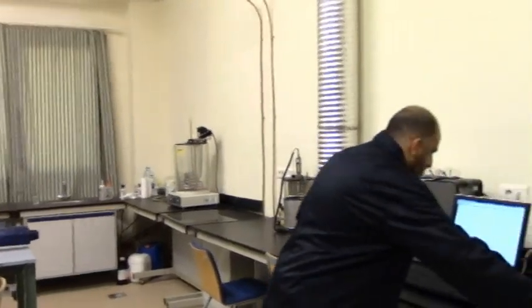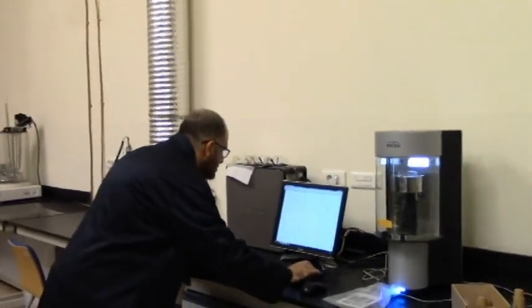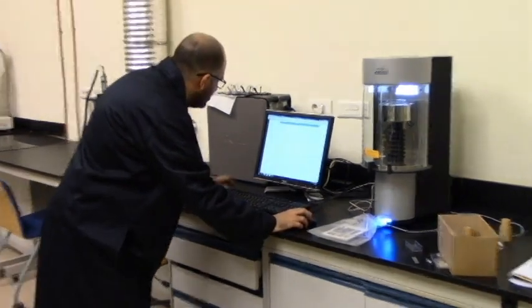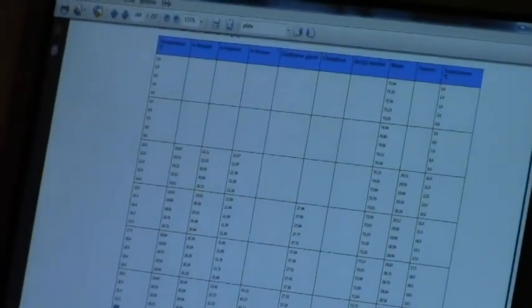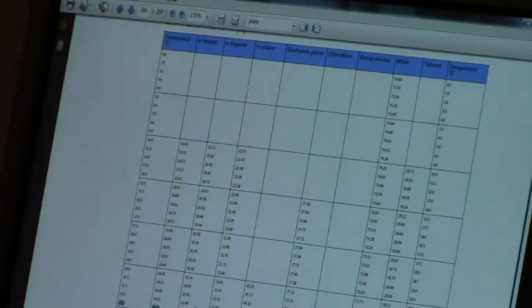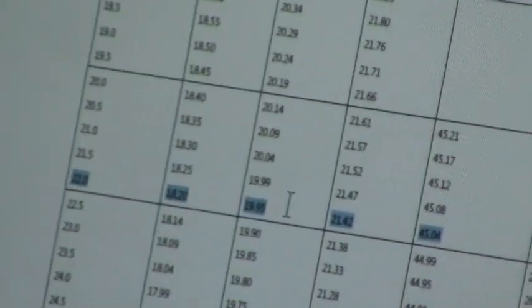And if you go back to our reference here, and see for this given temperature, for example, the same temperature, 22, which of these different liquids has got the minimum surface tension? Actually, it is N-hexane, which is 18.2, followed by N-heptane, which is 19.95. We will be using N-heptane because this is what we have available here in the lab. And I remind you that the water was about 72. This is just to compare the relative values.